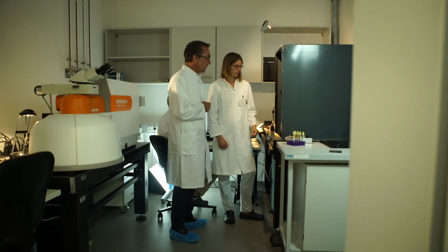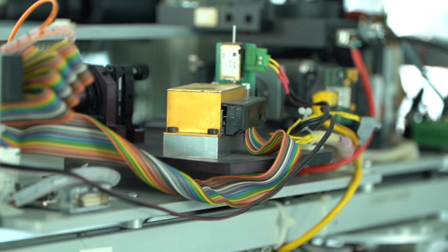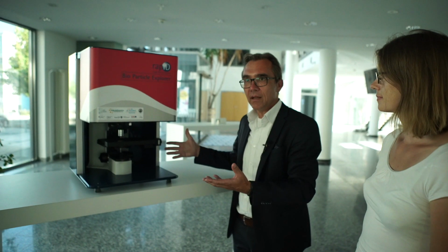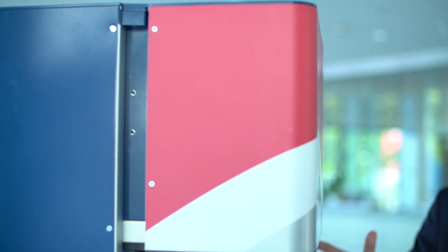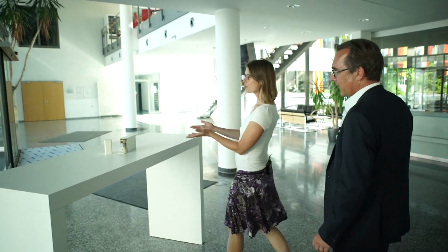And the lab-on-a-chip system will soon be able to fit into even the smallest handbag. Here we see the first version of a more or less portable Raman device. The next generation is no larger than a coffee maker, but ultimately able to do everything that we need to have done. This device, this technology is already being used in hospitals today. It'll be even smaller, more compact, and fully portable in the future. You'll be able to use it everywhere, even in places where there's little infrastructure. And that is our grand future.